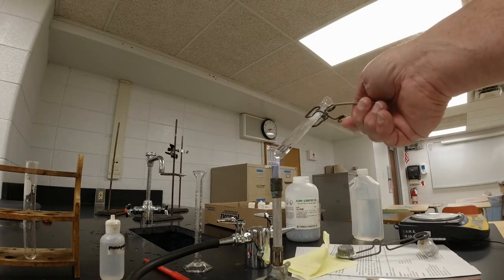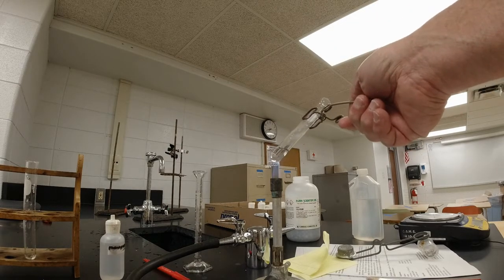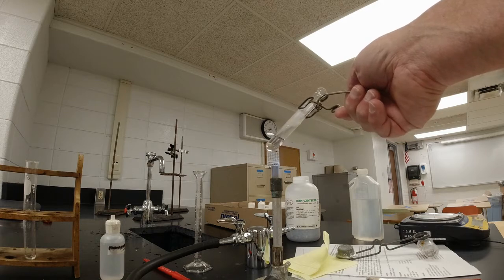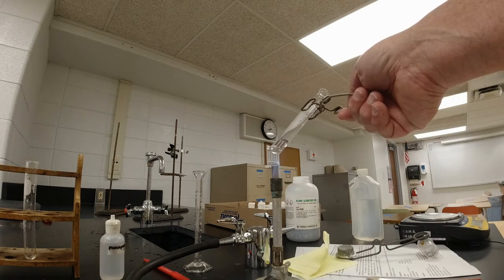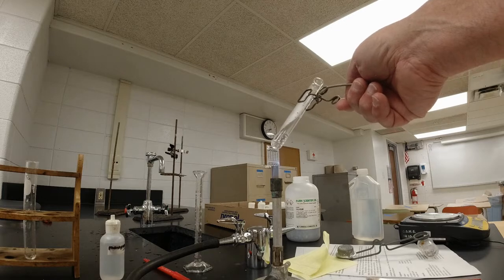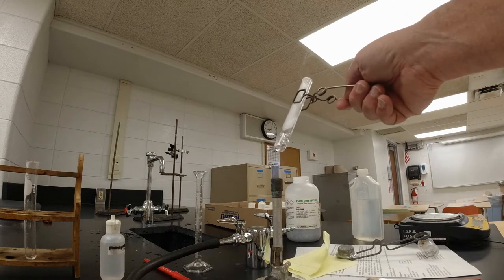Now when you boil it, you never turn the test tube straight up like this. You always tilt it to the side and away from anybody, so in case it splatters, it doesn't hit anybody in the face or hit them at all. And so I can feel it starting to boil. You see bubbles coming up there. It doesn't take very long for that little amount of water to boil. And so, wow, that's really boiling fast. I'm going to keep it boiling.